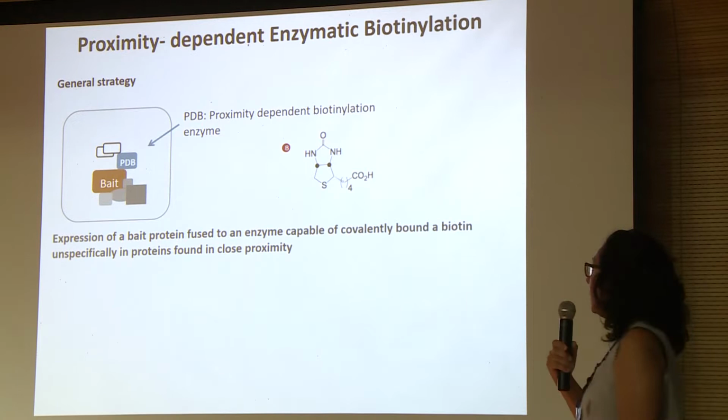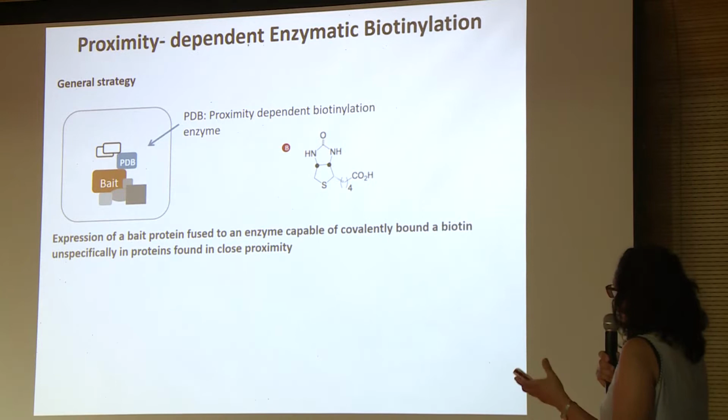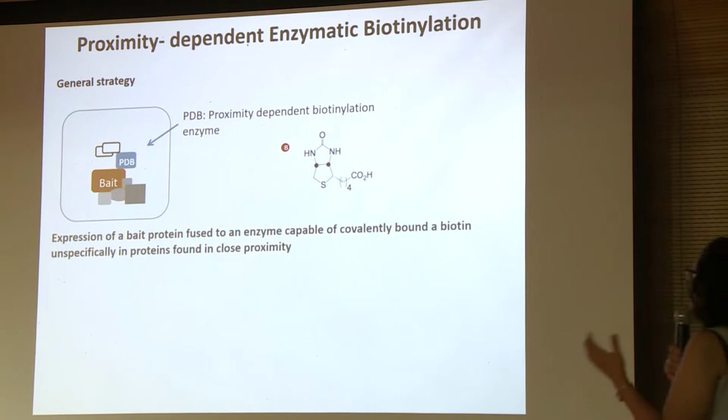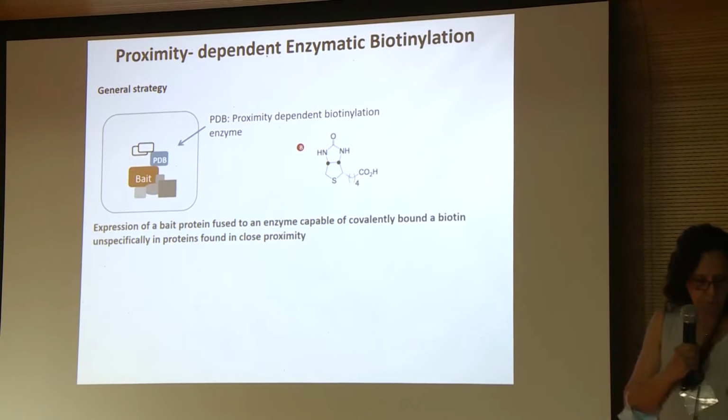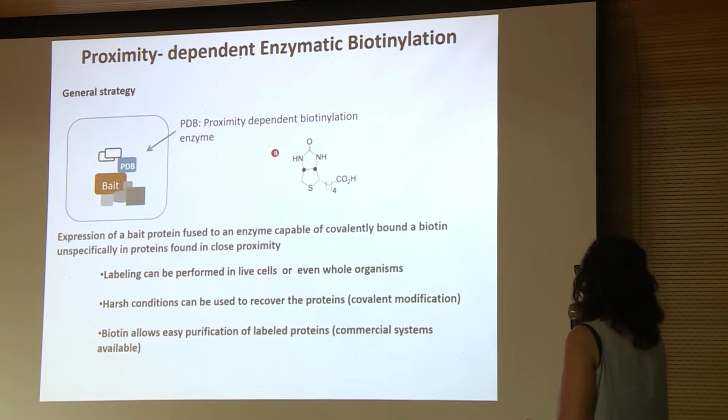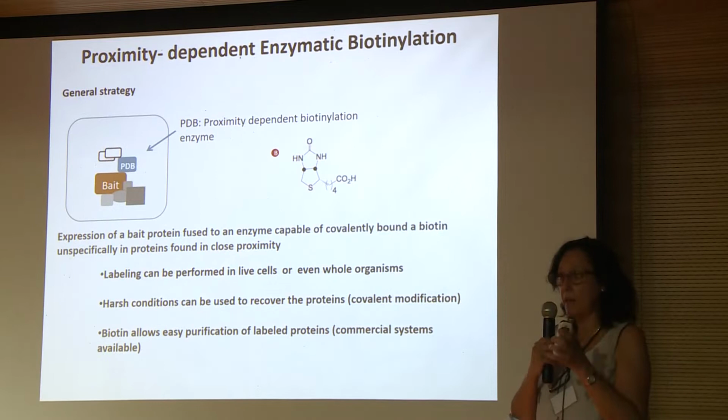So, you have to express your bait fused to this protein in your cellular system, and then the protein, which is an engineered protein especially designed for this purpose, will introduce the biotin. So which are the advantages of this strategy? Well, labeling can be performed in live cells or even in whole organisms, so you are going to be looking at what really is happening inside the cell.